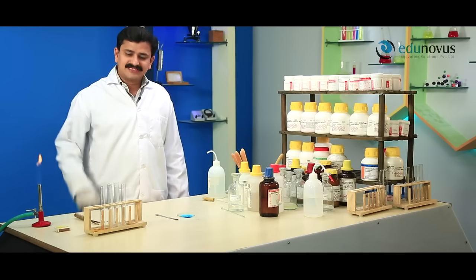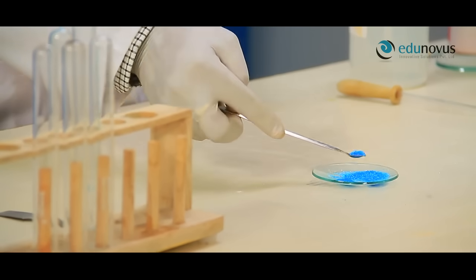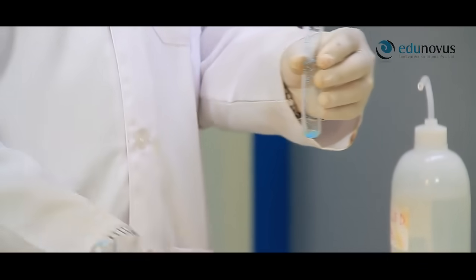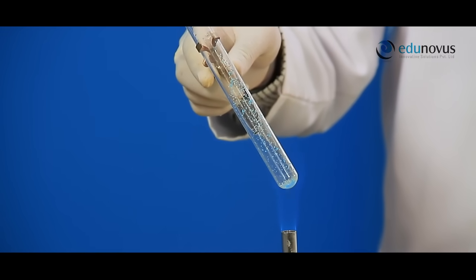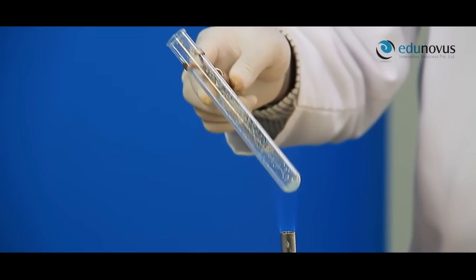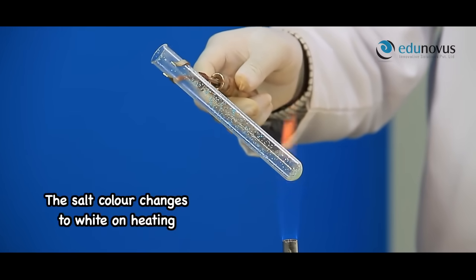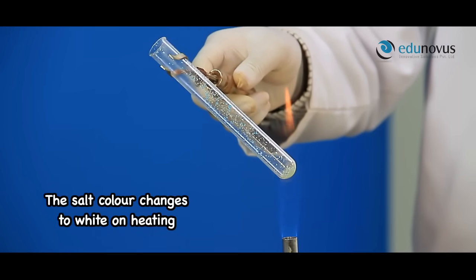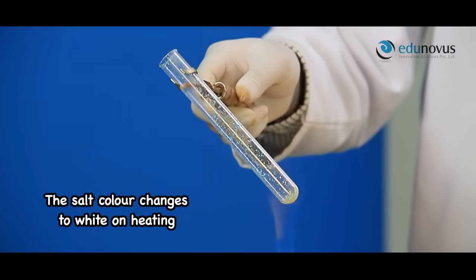Take a small amount of given salt in a clean and dry test tube and heat it using Bunsen flame. Here you can see the change in color of the salt from blue to white. In this way, if the salt is white when hot and blue when cold, it infers that the given salt may contain cupric cation.